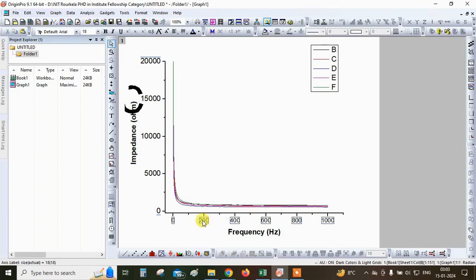And also a single click here and then we can increase the font size. Now the major part comes, that is when we have to enlarge or maximize the area where we can actually analyze or understand what the impedances are in the samples, or what variation in the impedances there is in the samples.